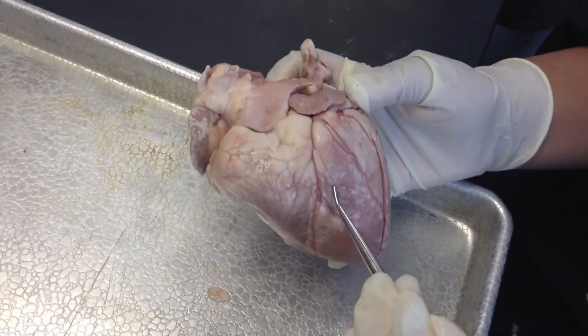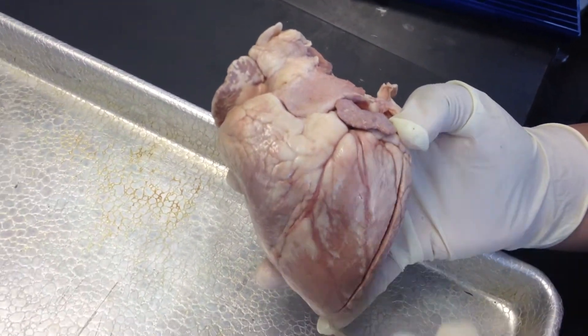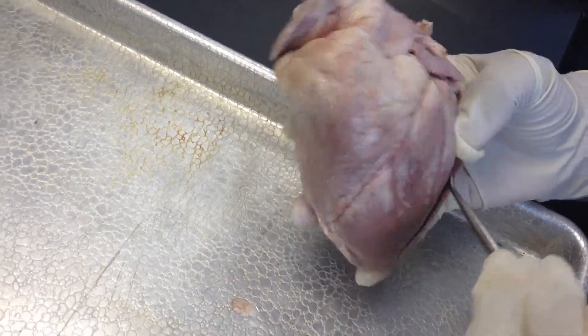This is the sheep heart. Right here is the left ventricle. How do you know this is the left ventricle? Because it's very muscular.